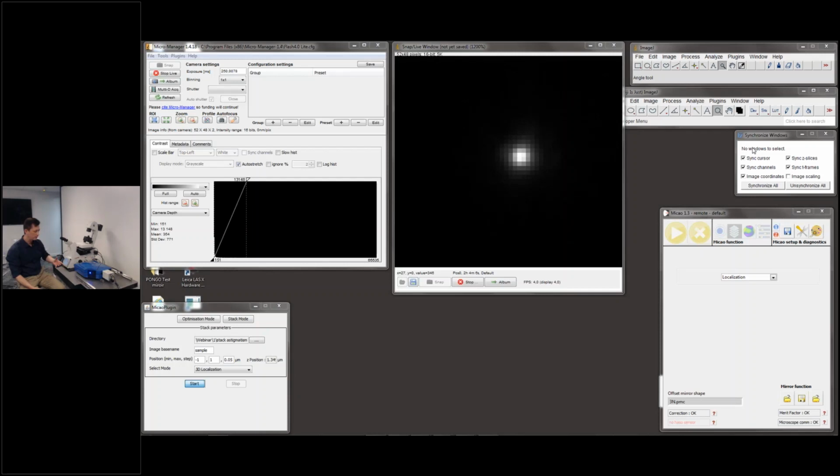And after this, we do the first optimization, the closed loop measurement, which gives us already optimized, corrected aberrations of the optical setup, like system aberrations. Then we replace the camera, and all other improvements of the point spread function, we are using image-based algorithms.